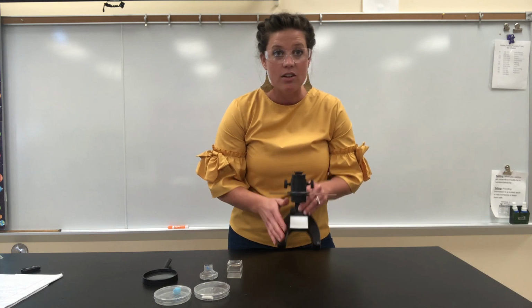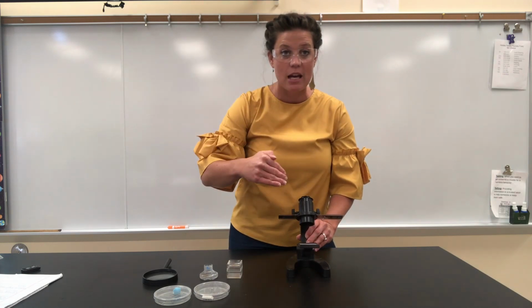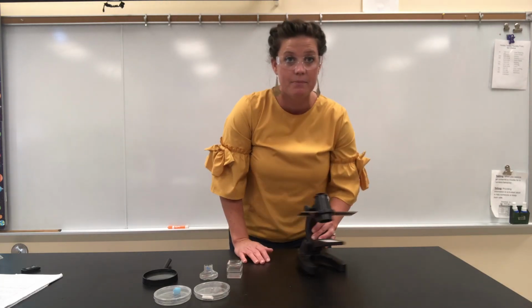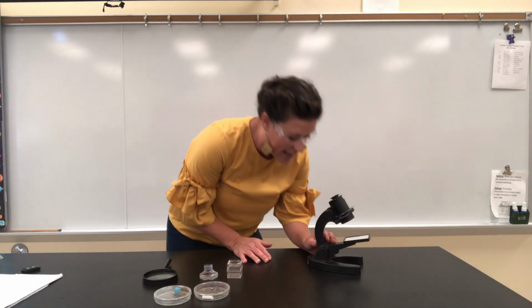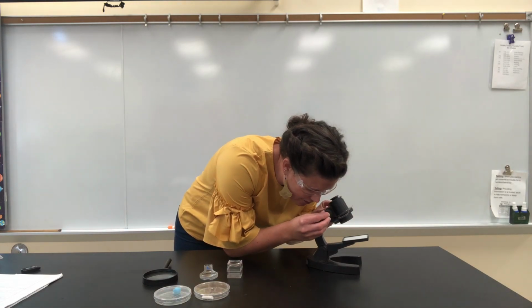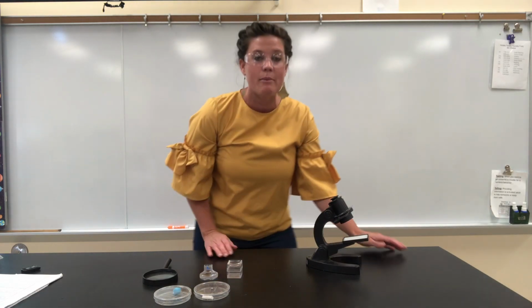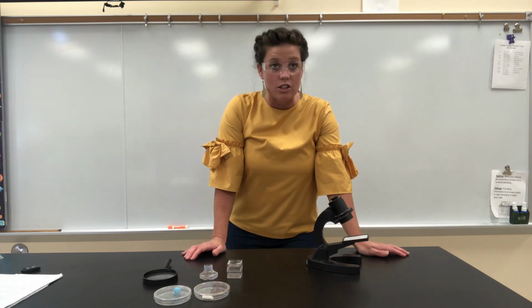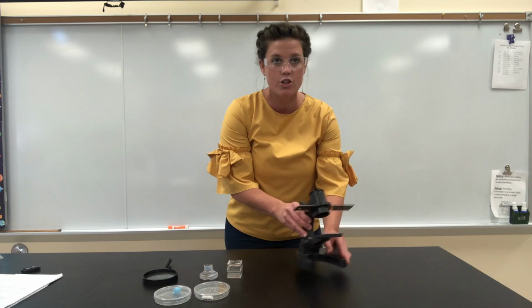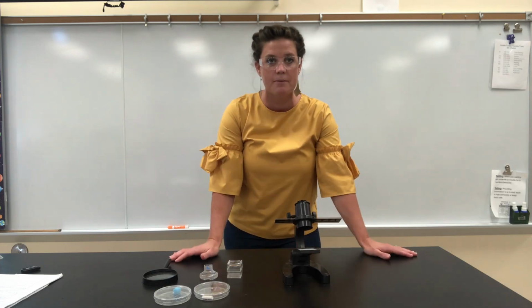This white rectangle is reflecting the lights coming down from the ceiling so that I can see when I look through the eyepiece. Now I'm going to look through the eyepiece and use the knobs to turn and adjust the focus. Everything in the microscope should be crystal clear. If it's blurry, then it's not quite focused. All right, so you'll turn those knobs until it is focused.